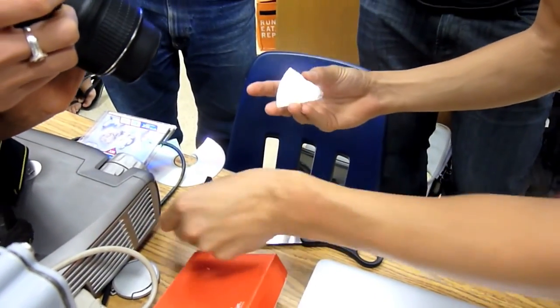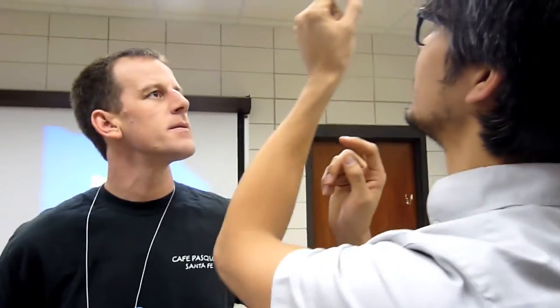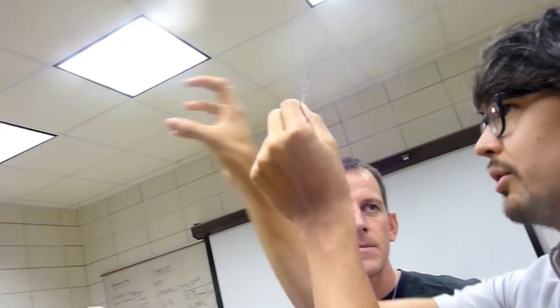Oh, wow. Look at that. And so this is a really nice piece of grating. And what's that? That is the bottom edge. Yeah, it's the bottom edge. The label came off from the other one. You can already see it from here, lighting up with sort of the prismatic effect. You can see the spectrum already, especially because these are discrete lights, so you can see the blue, green, red through these.